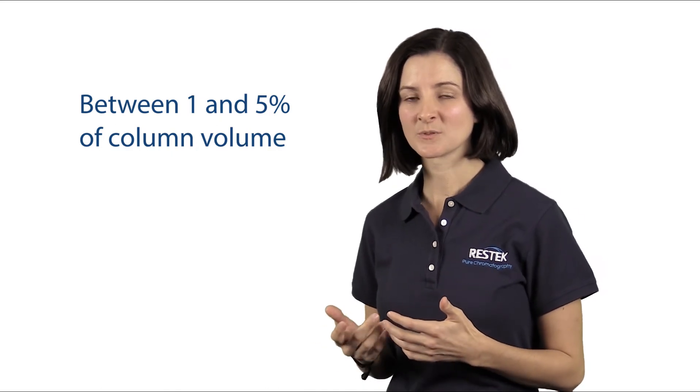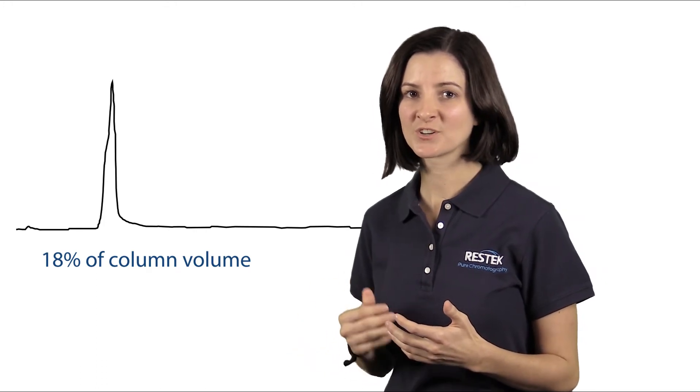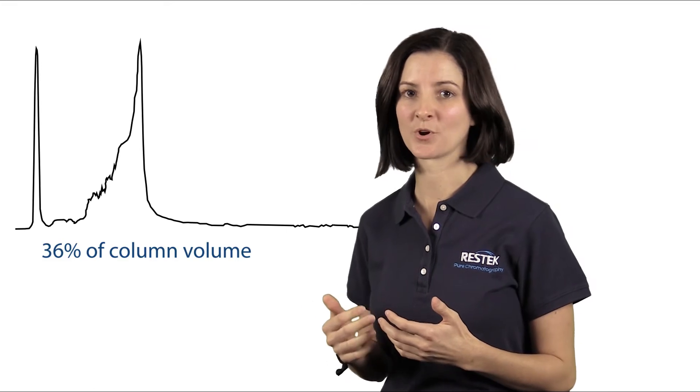When we talk about injection volume, a good rule of thumb is to aim between one and five percent of the total column volume. As we start to exceed that five percent, we'll start to see some peak fronting, which is always a very good indicator that we're reaching capacity and starting to overload our column.